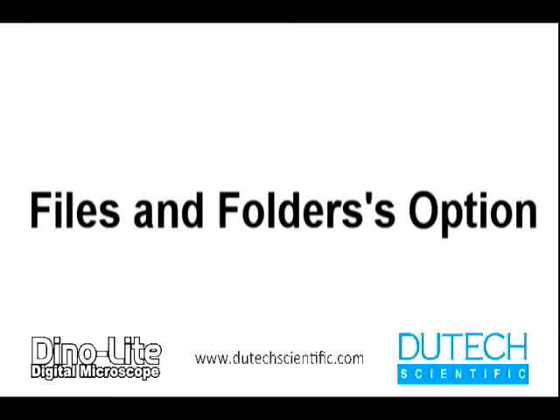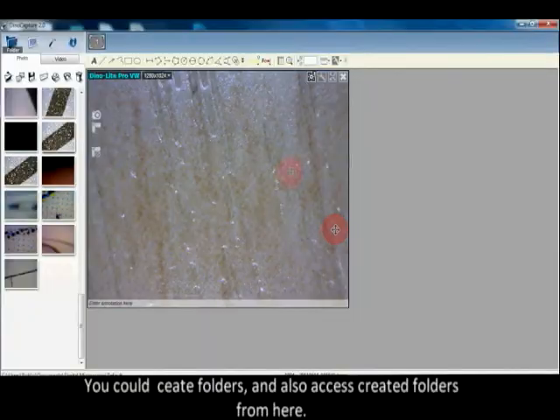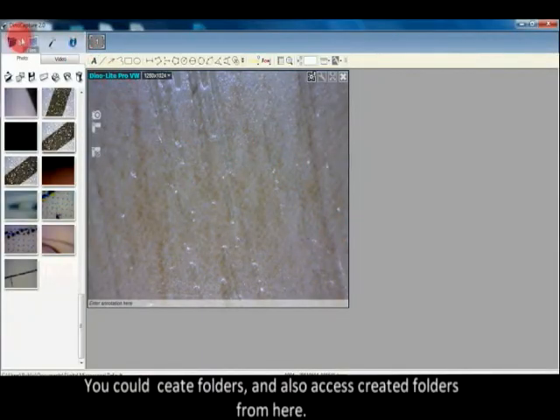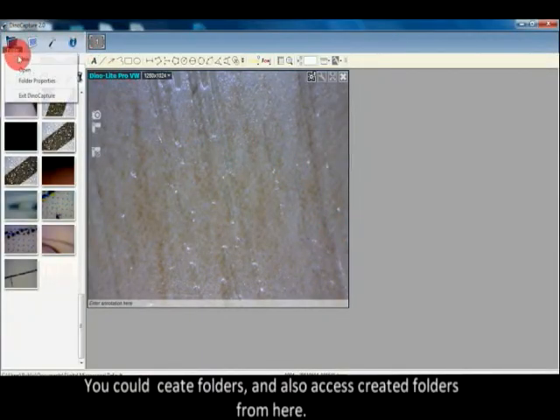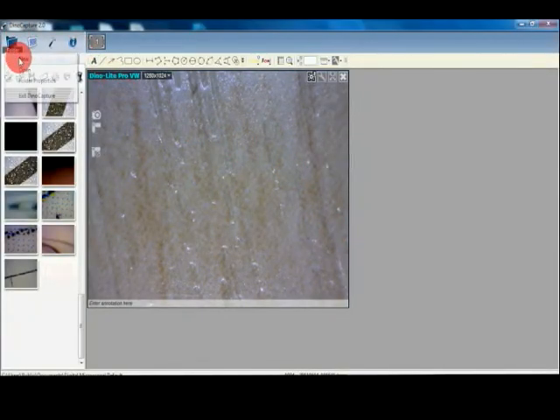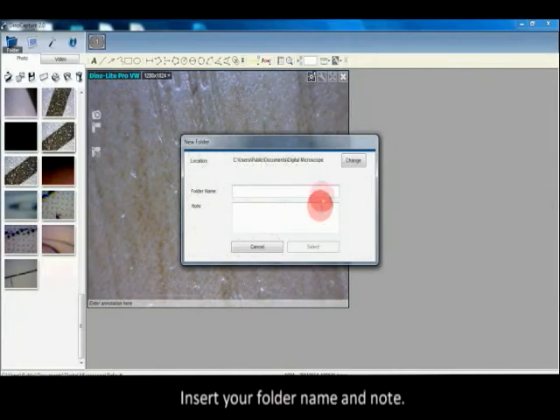Files and folders option: You can create folders and also access created folders from here. Insert your folder name and note.